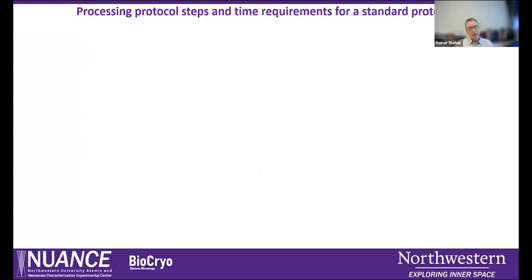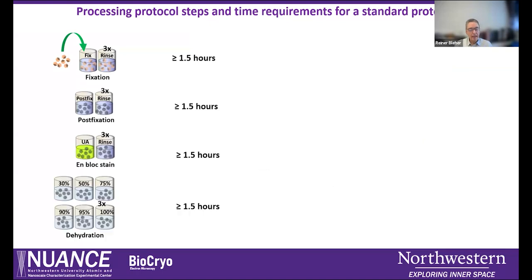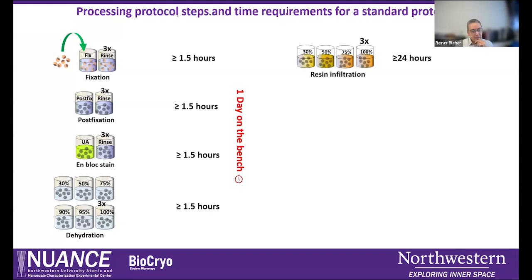So when we look at the time that we have to invest to complete all these steps, each fixation, post-fixation, staining, dehydration takes at least, for a very simple standard protocol, 1.5 hours each. And this means it keeps us busy one day in the lab. We must also see that resin infiltration usually includes a step that goes overnight.